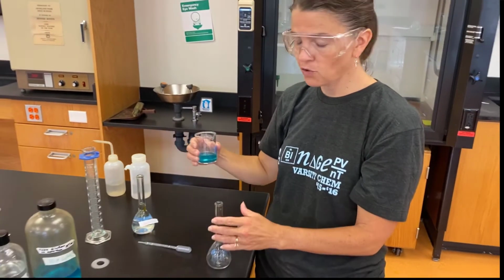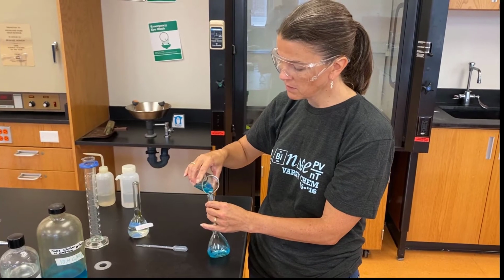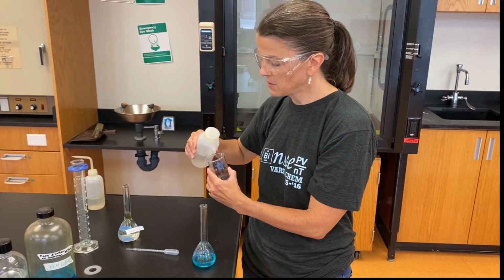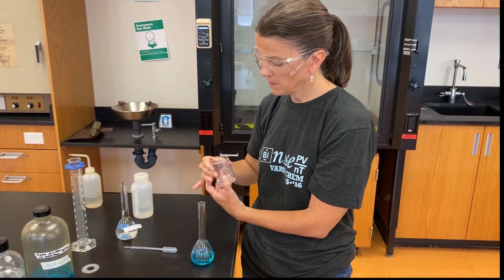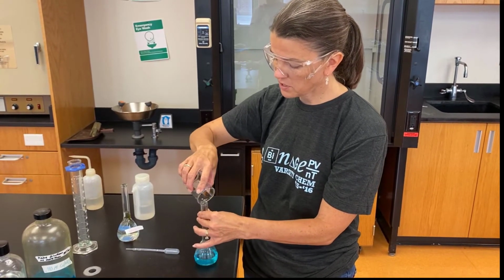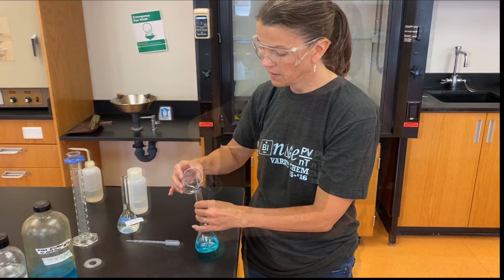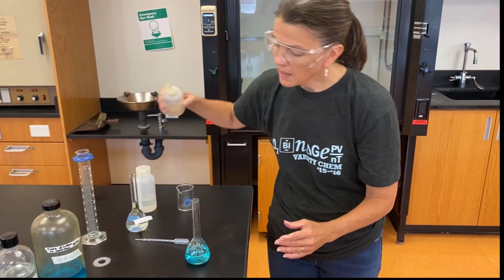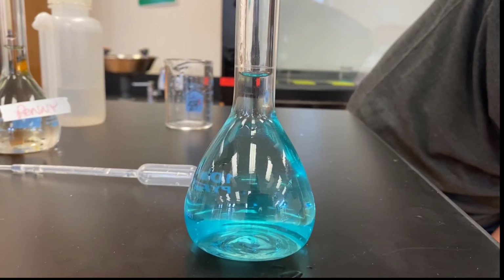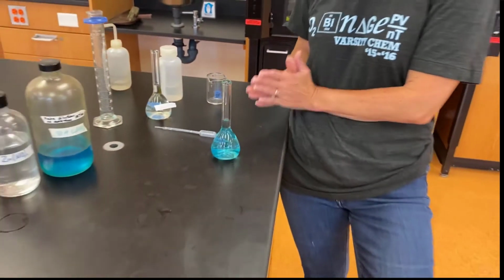Good thing that you learned how to do quantitative transfer in an earlier lab. So I'm going to carefully pour my solution into a 100 ml volumetric flask. Because I don't want to lose any of it, I'm going to rinse my beaker and pour that in. And I'm actually going to do that a couple of times because I don't want to lose any of my sample. I'm not even going to use a funnel or a stirring rod. And then I'm going to top it off to the 100 milliliter mark. And there we go. And now I have a solution that is exactly 100 milliliters.